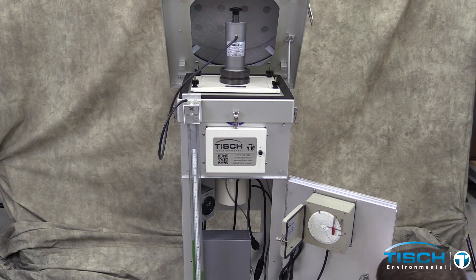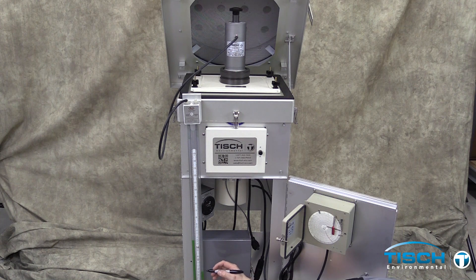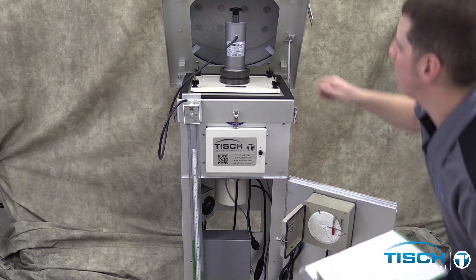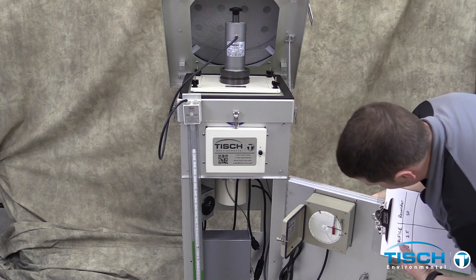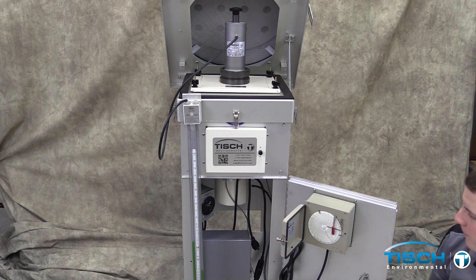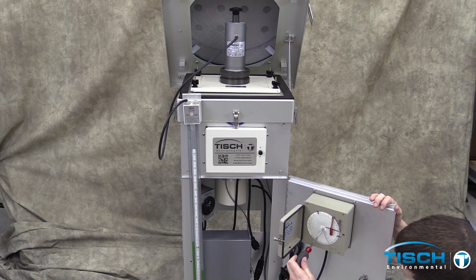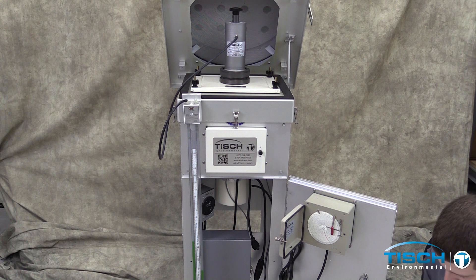Next, read the manometer. One side will go up and the other side will go down — you will need to add both numbers together to get the correct manometer reading. Slightly turn the knob on the calibrator clockwise. Using the screwdriver, turn the chart drive clockwise to get another line reading. After you get a chart reading, take another manometer reading.